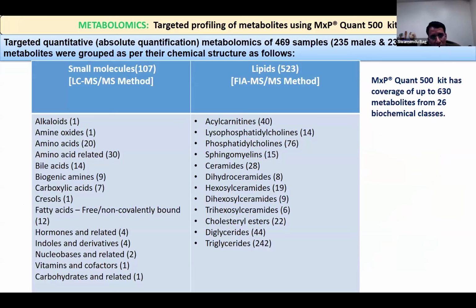For small molecules, we adopted the LC-MS method as per the standard protocol of the kit. And for lipids, we adopted the FIA-MS method, which is flow injection analysis. In this case, we are bypassing the LC part. We directly inject the samples into the mass spec.